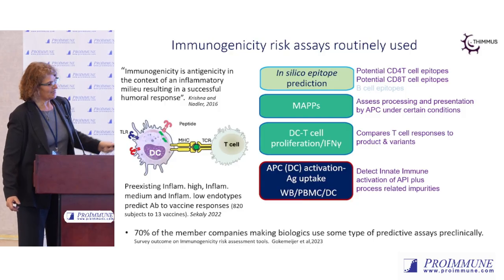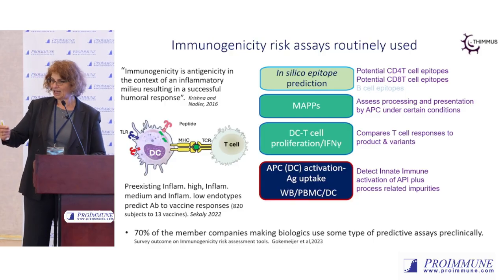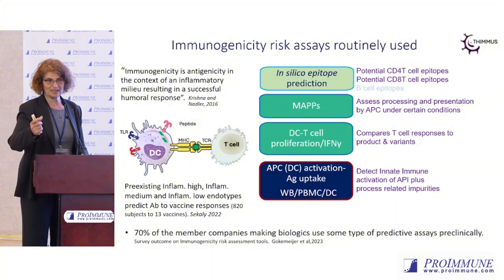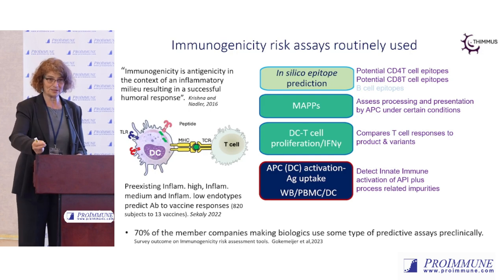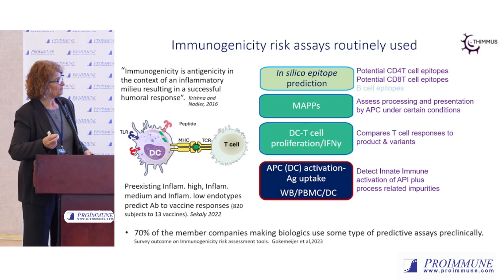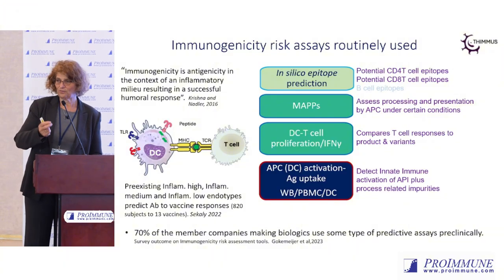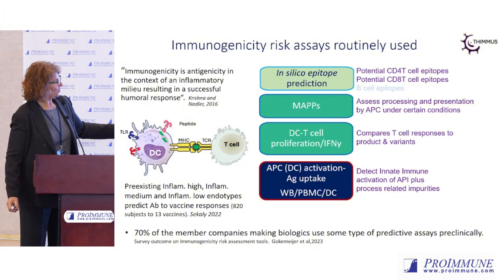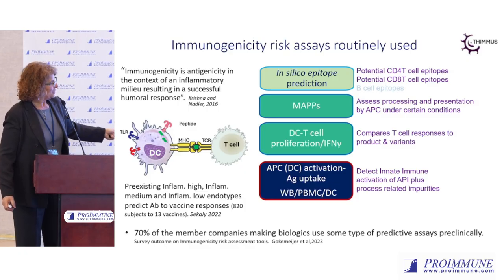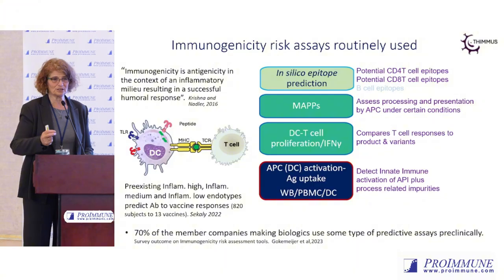There's a number of assays, such as the MAPS assays, or I believe the REVEAL assay, that look at actual affinity, or look at what the APCs are actually capable of presenting in the context of MHC, or by looking at the affinity of the peptide or the epitope for MHC. There's a number of assays that look at what the T cells do in response to that.